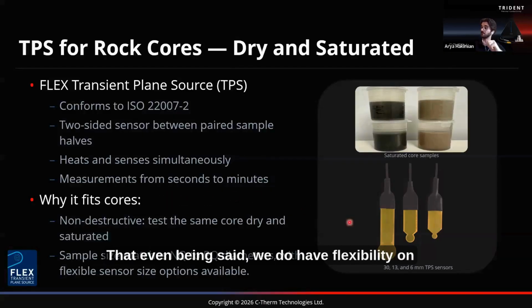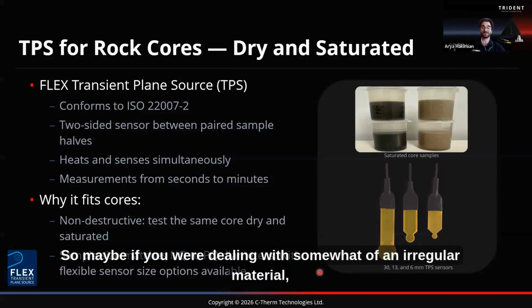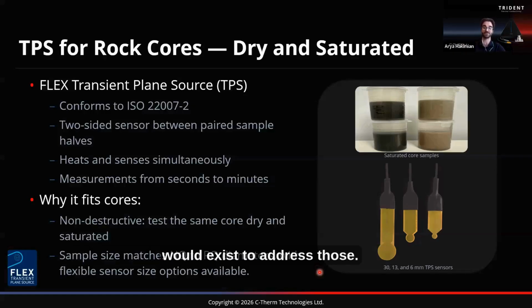That even being said, we do have flexibility on our TPS sensor sizes, so there are varying options available. So maybe if you were dealing with somewhat of an irregular material, we can certainly have a discussion around what options would exist to address those.